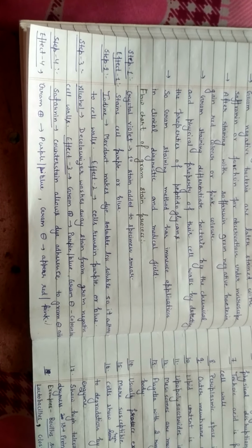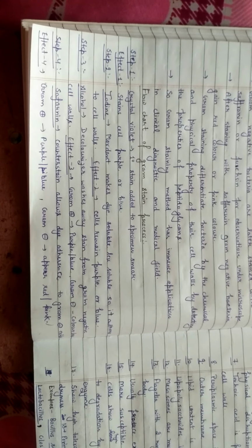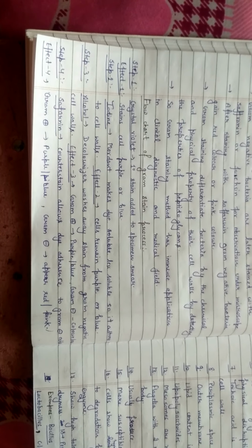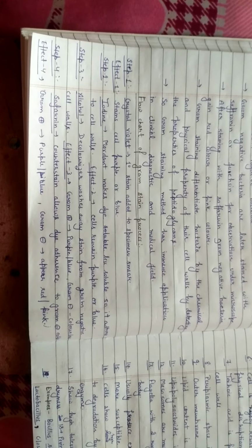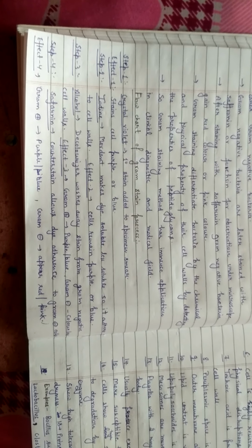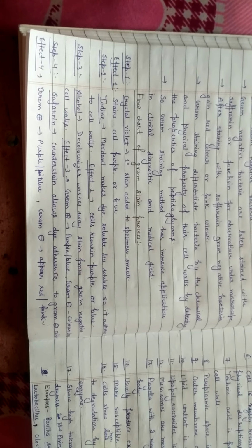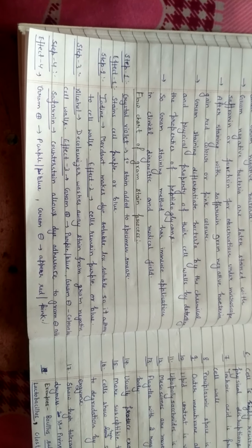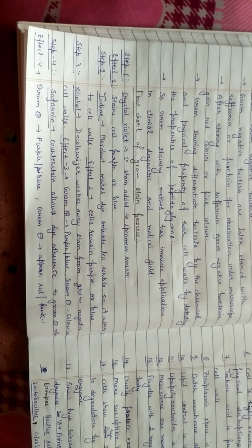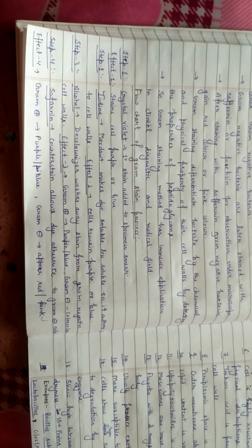Christian Gram first stained both the gram-positive and gram-negative bacteria with a dye, crystal violet, or we can say gentian violet. Both gram-positive and gram-negative bacteria, when stained with this crystal violet dye, retain the stain and appear purplish or bluish in color. So after staining with crystal violet, both bacterial species gain the purple or blue color.